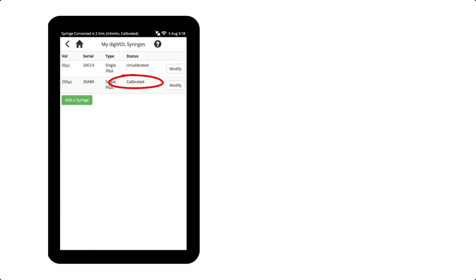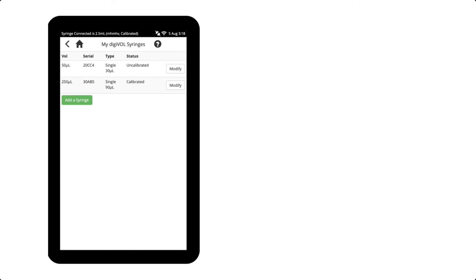You can now see the status of the syringe has changed to Calibrated. The syringe can still be used to dispense any volume from 10% to the maximum volume of the syringe, but will only be calibrated when the volume is ±5% of the nominated calibration volume. For this particular calibration, that means the volume dispense will need to be in the range 85.5 to 94.5 microlitres.